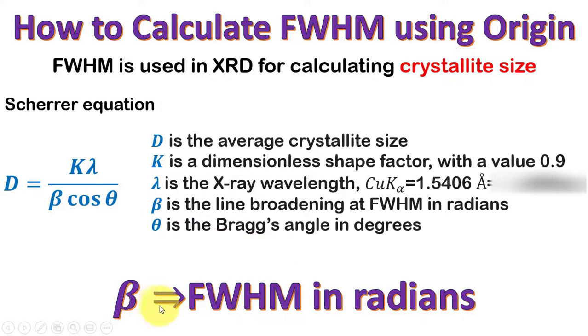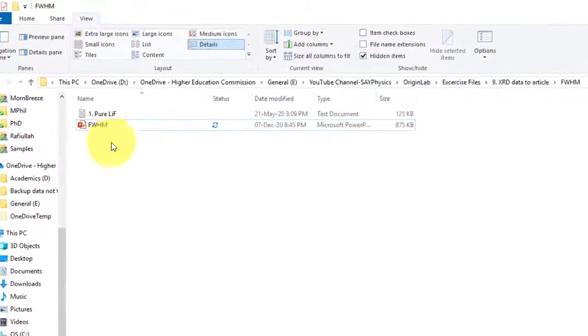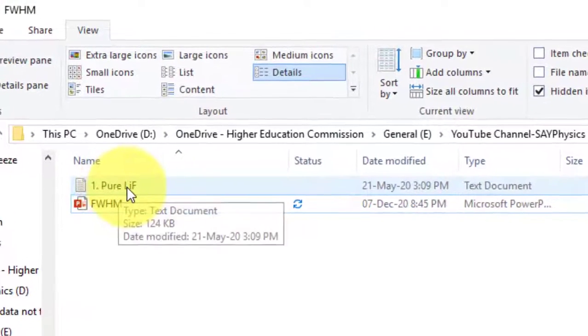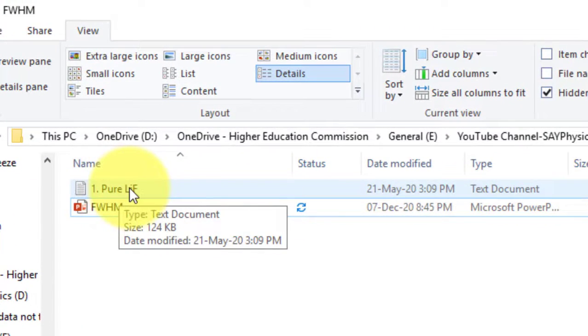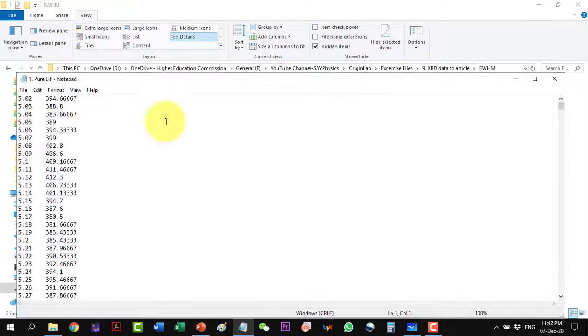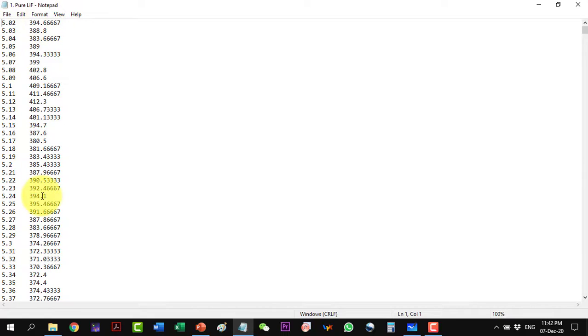We will calculate in this video how we can use Origin to calculate FWHM. Let us start with our data which is of the pure LiF. This is the XRD data which is in two columns. This is the two theta values and the intensity of the XRD.